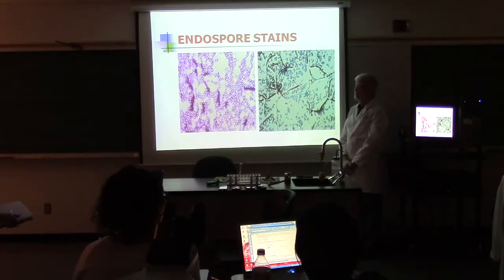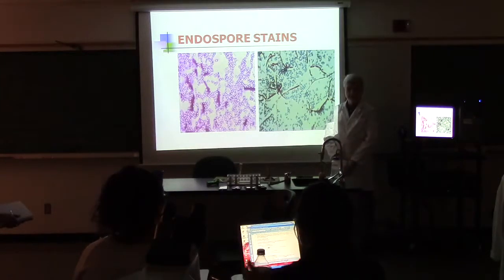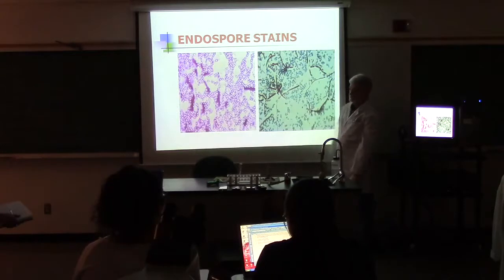All right, number 2, is it rods? Yes, there are rods. Number 3, do the rods have holes? Yes, they do. So what is it? Endospore positive. Ignore the green.